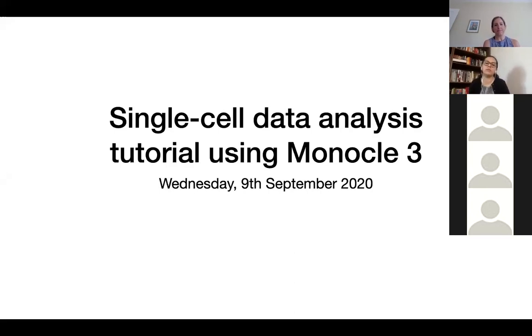Today we will be doing some advanced single cell data analysis. In the past, we've had other tutorials for intermediate and beginner levels. But today we'll move forward and try to deal with the more complex areas that people are getting into and need more help with.